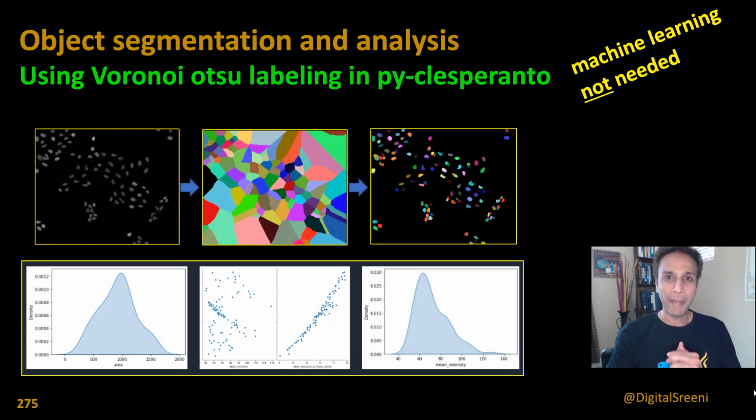Hi everyone, welcome back. In the last couple of videos, we established a little bit of groundwork for this video. Initially we started by talking about voronoi. We understand what it is now, hopefully. If not, go back to video number 273. And in the last one, we did a step-by-step approach of establishing the concept of object segmentation using this new voronoi-based segmentation approach.